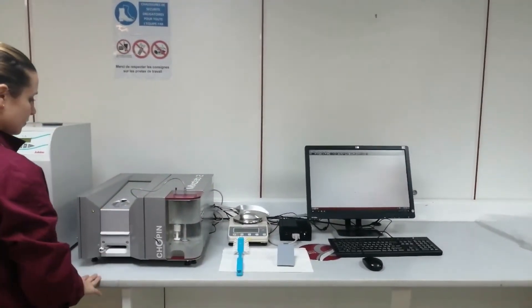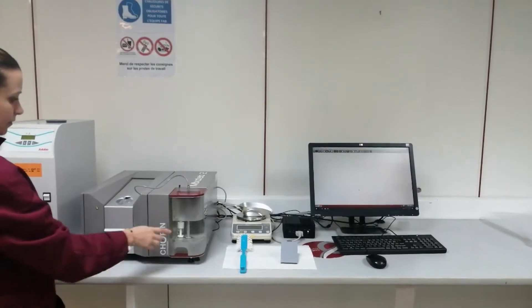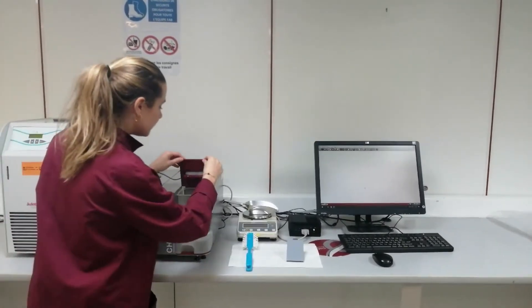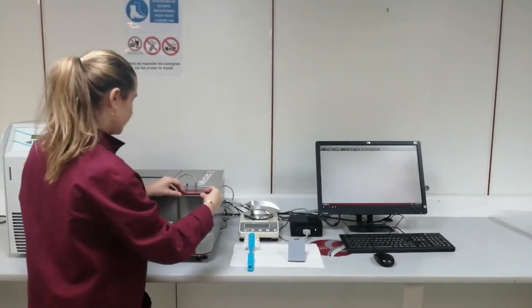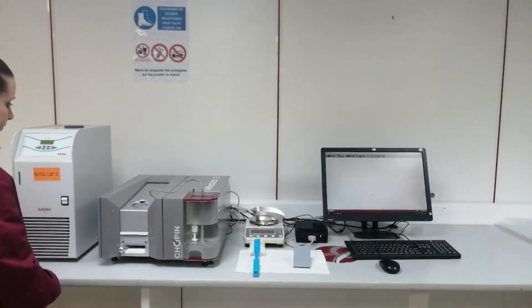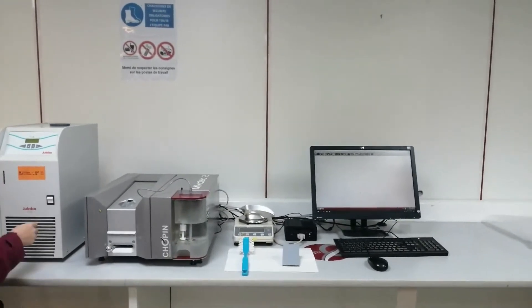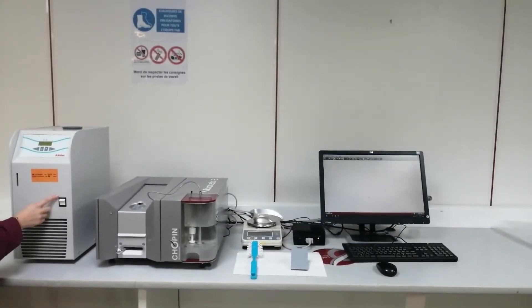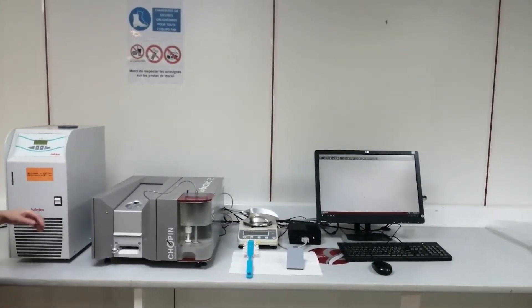Before powering up the device we have to check if the water tank is empty and fill it with distilled water if necessary. Now we will turn on the cooling system and turn the Mixolab on.